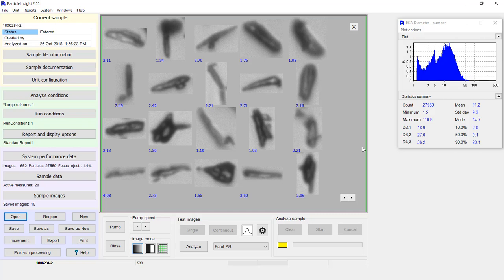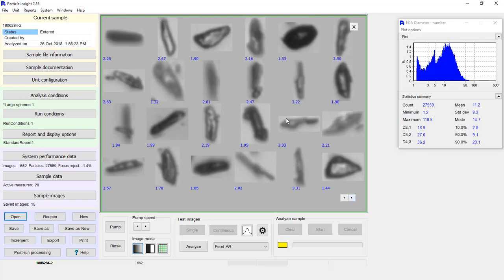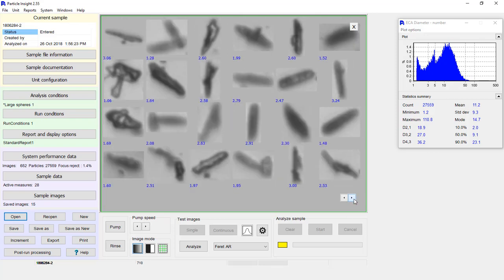Anyway, very interesting. Again, if I knew what these samples were, maybe these particles would be of interest. We can determine what population of blocky particles there is compared to fiber particles. That's something we can do. We can do different comparisons. These are definitely a bit out of focus, but still gave us some pretty decent information.